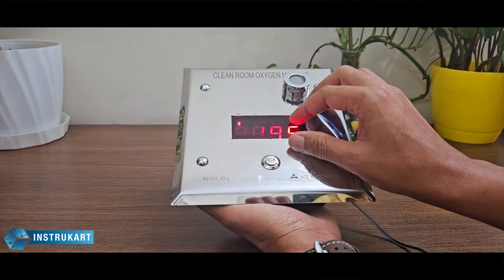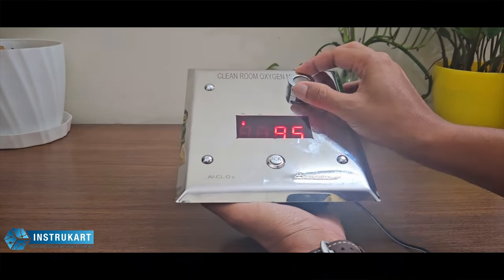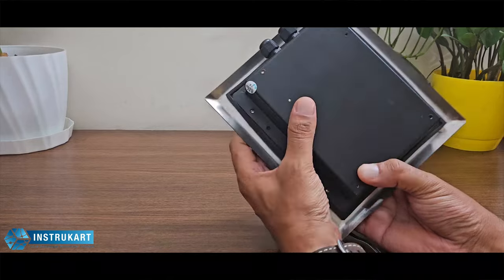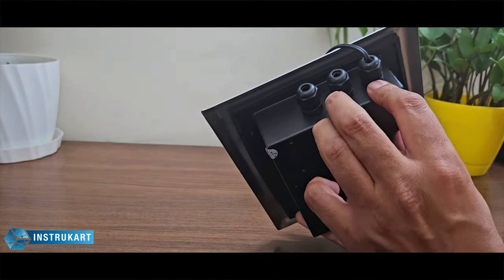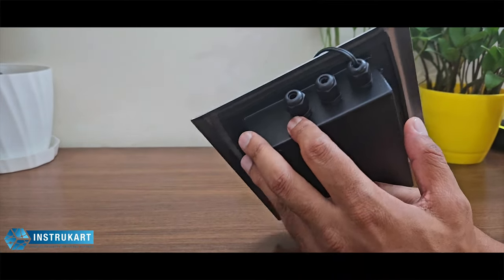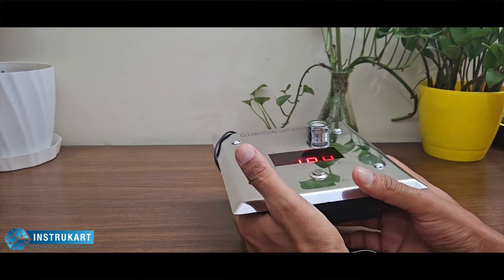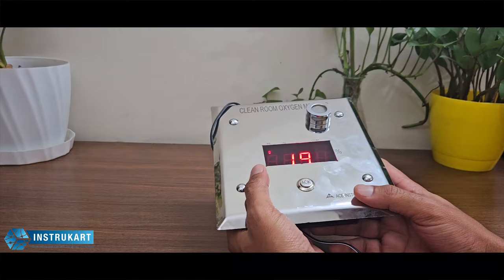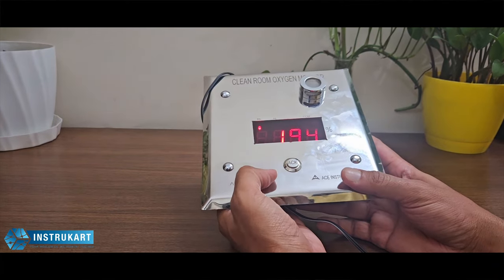A big LED display, around one inch, shows the volume. This is the oxygen sensor at the back. You see the MS body with all the glands provided. The input is 24 volts DC, and these are the communication options provided for the instrument. For the accuracy, it has got plus or minus one percent accuracy, available in 0 to 25 percent range only.